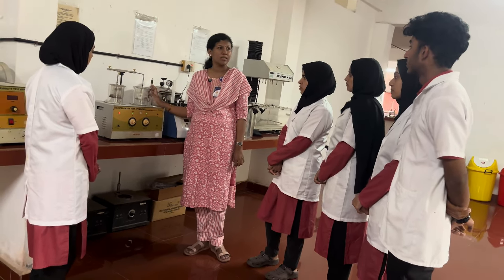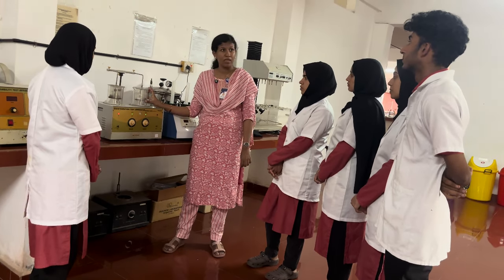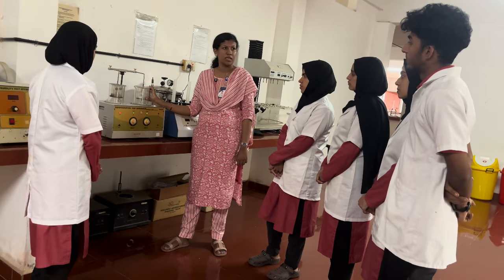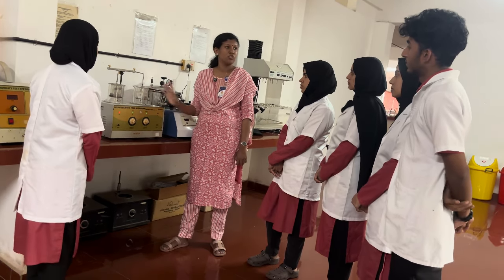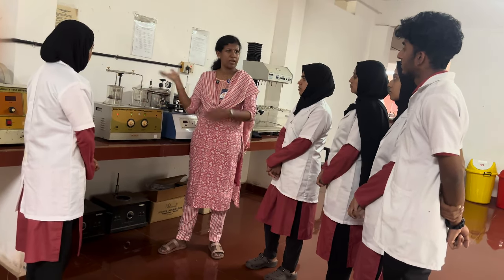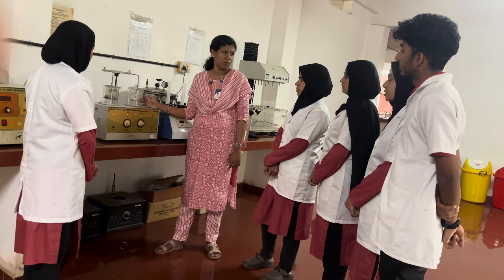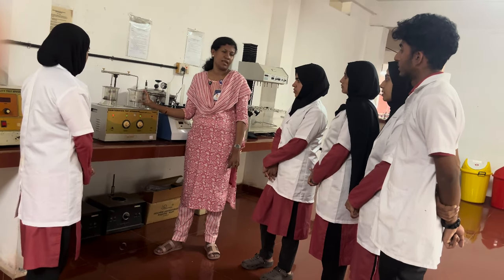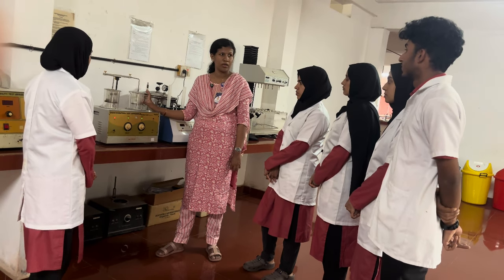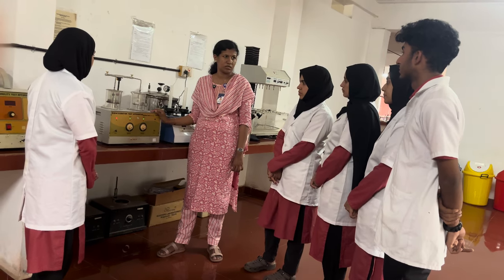Then only the tablet should get disintegrated, and that we have to check. If we have an enteric coated tablet, first we will check it in the gastric fluid. It should not disintegrate for 1 hour. Then we will replace the gastric fluid by simulated intestinal fluid. Then it has to disintegrate within 2 hours. So that is how you can calculate the disintegration time using this apparatus.